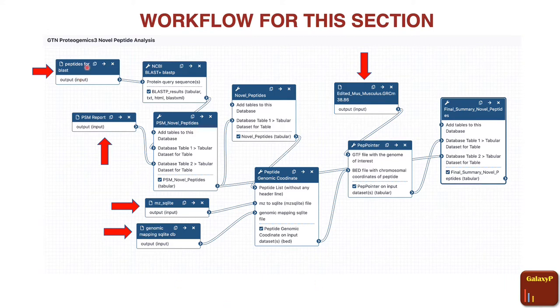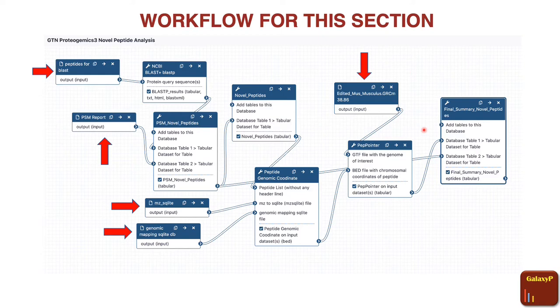Your workflow looks something like this. The arrow marks pointed here are basically the inputs required to run your workflow. As mentioned before, there are peptides for the BLAST-P analysis, the PSM report, the mz2sqlite file, the genomic mapping SQLite file, and the edited Mus musculus file, which you obtain from running the first tutorial workflow. Now let me do a hands-on overview of the workflow.